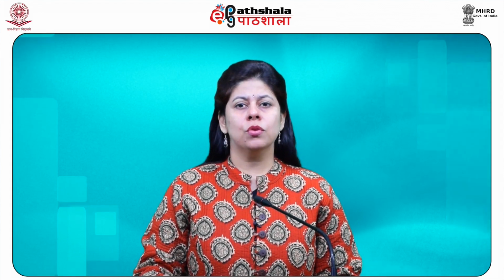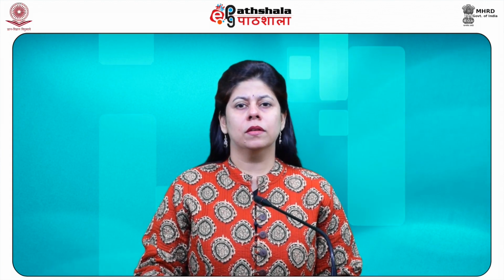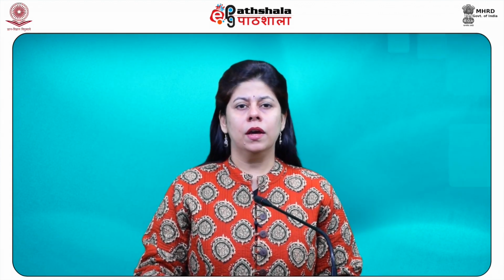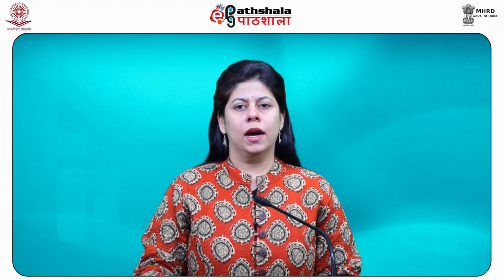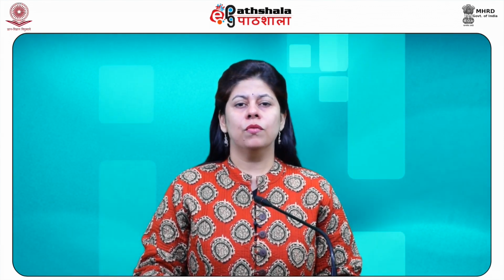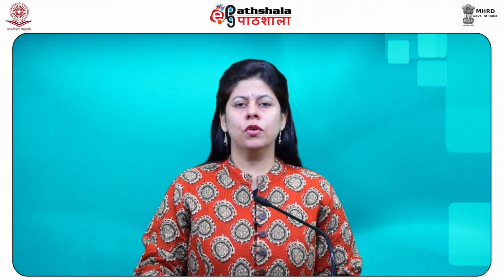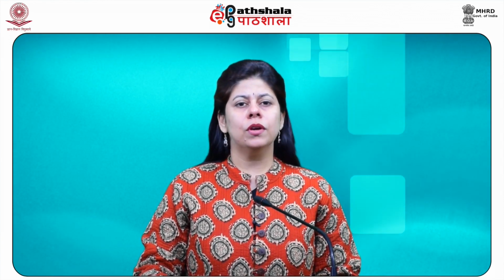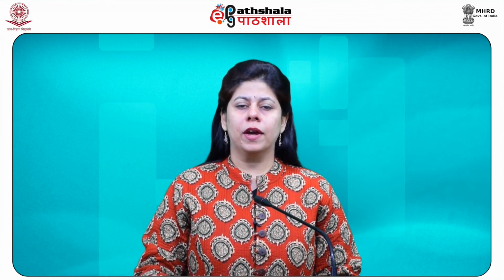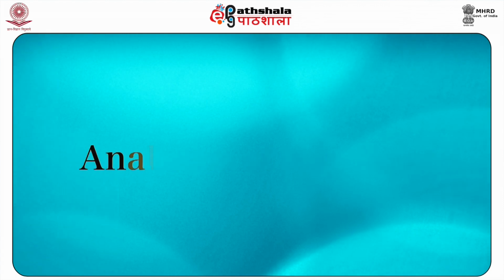The ionization source, analyzer and detector of the mass spectrometer are maintained under high vacuum so that the ions travel smoothly through the analyzer to the detector without any hindrance. This also minimizes the chance of collision of ions with other molecules so that they do not react, scatter or fragment.